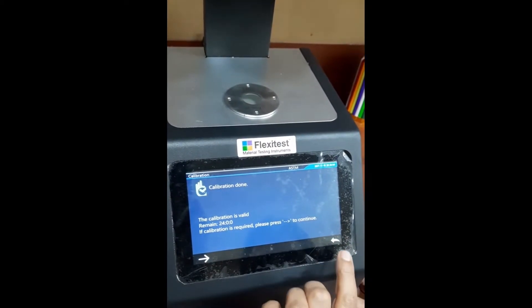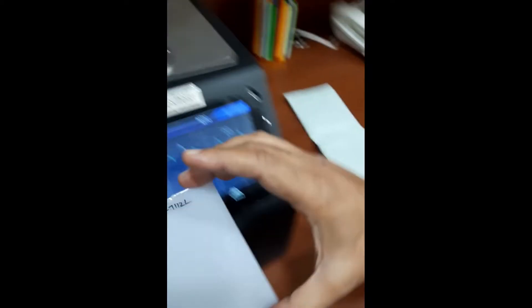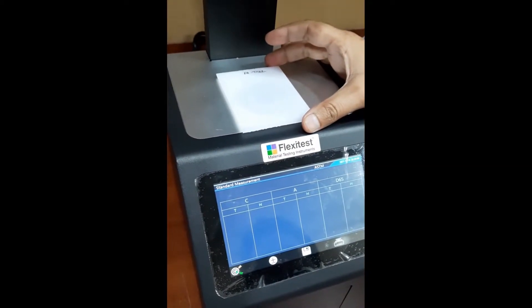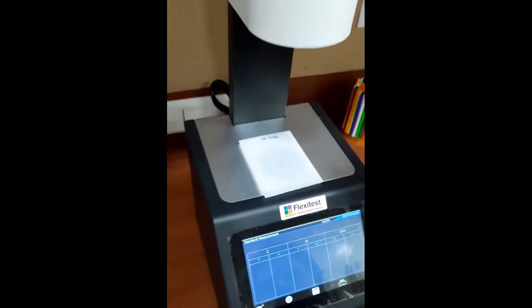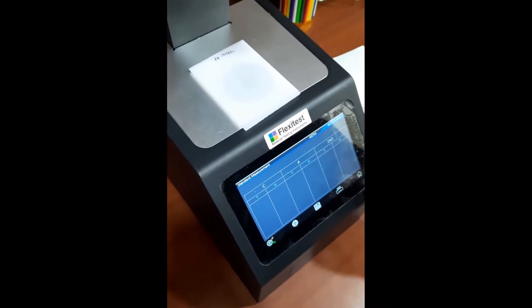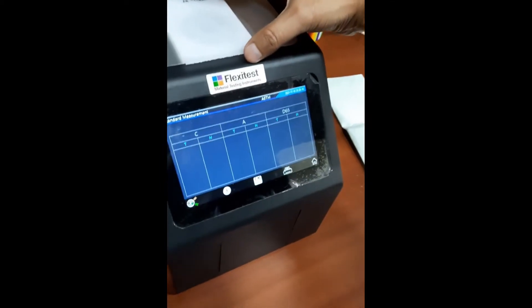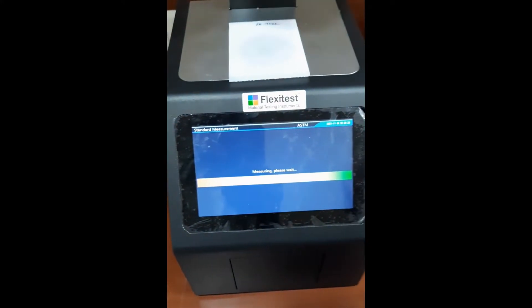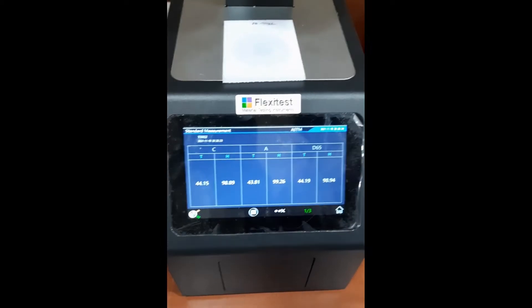I will get that on the main screen. I have this sample to test. At the source side, I will press this button — this is the test button — and these are the readings I am getting.